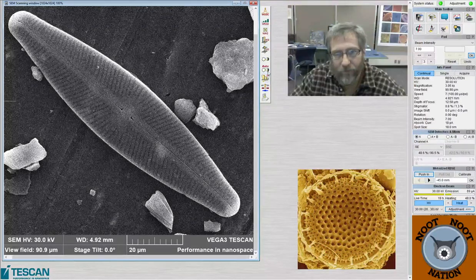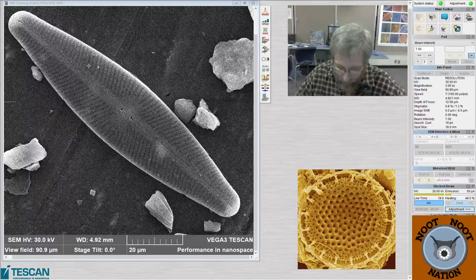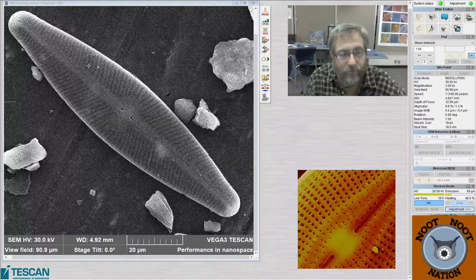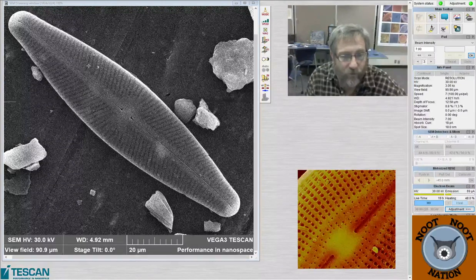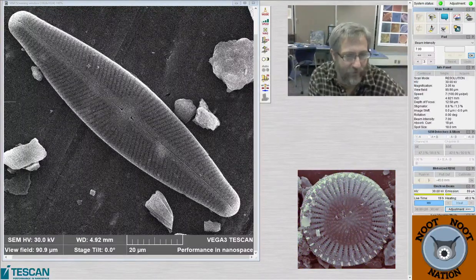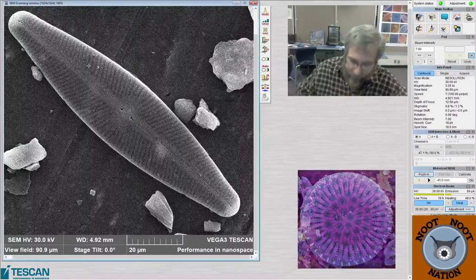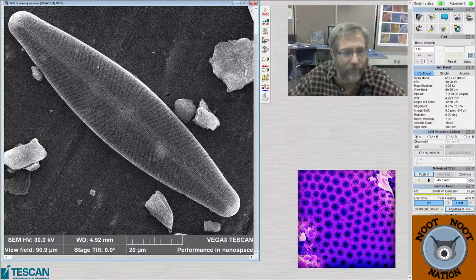And then we chop them into pieces, date the samples, and then process them and prepare them. Some of my projects span back 10 million years. That's probably about the oldest, maybe 10 or 12 million years. I don't spend a lot of time outside of the Miocene, basically. But from the Miocene to present, I will work in those, or have worked on those samples, and will continue to work on those samples.